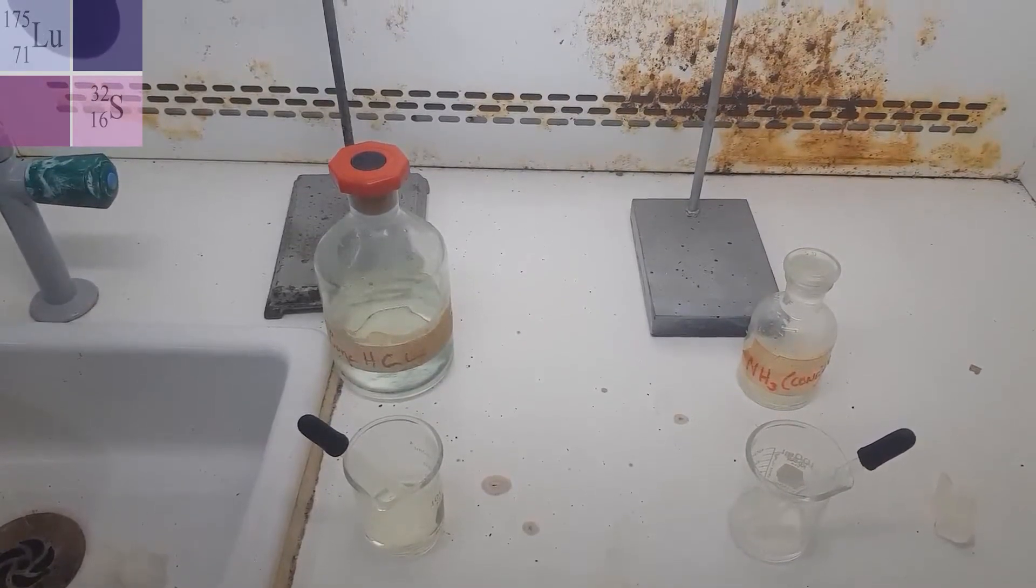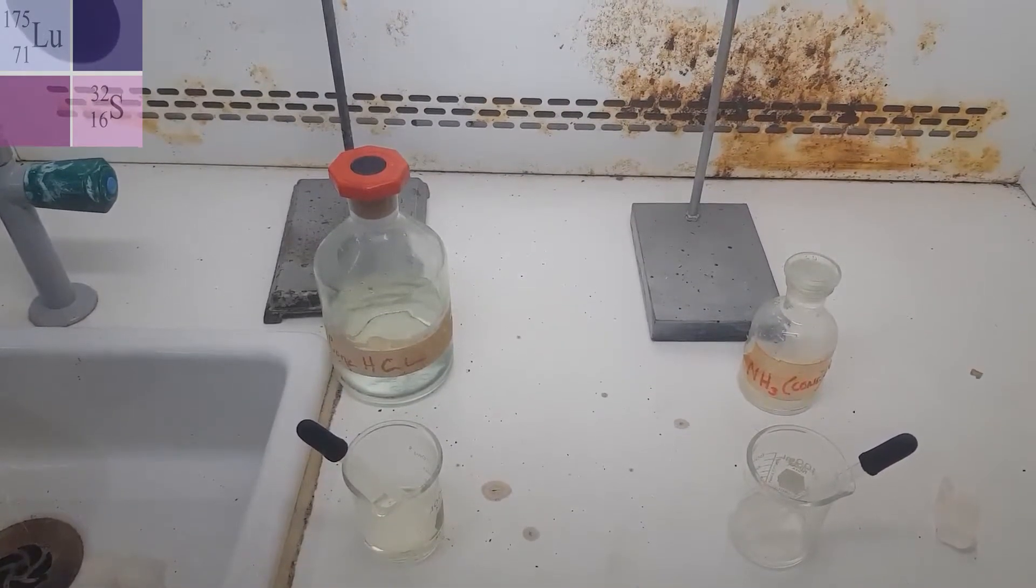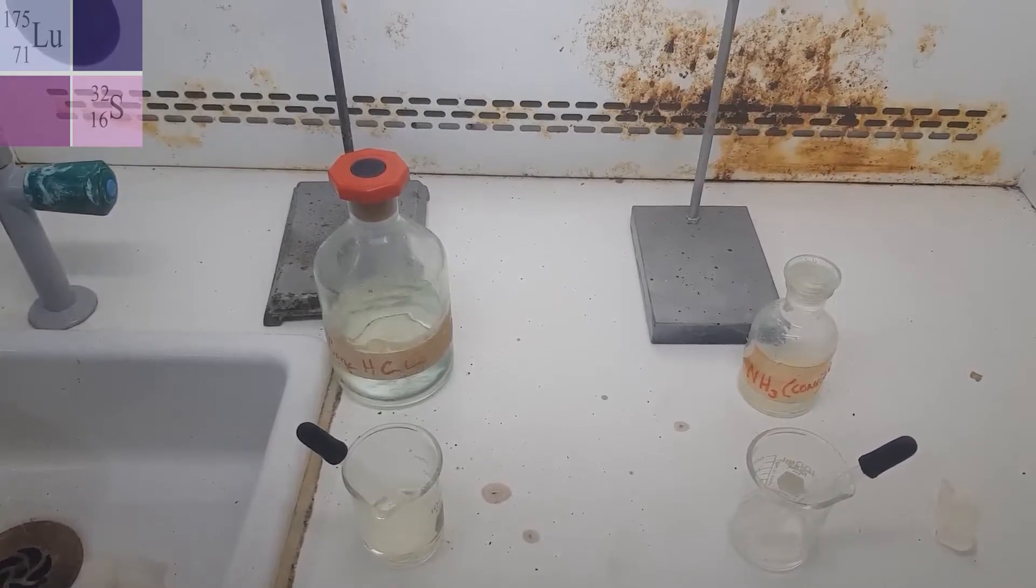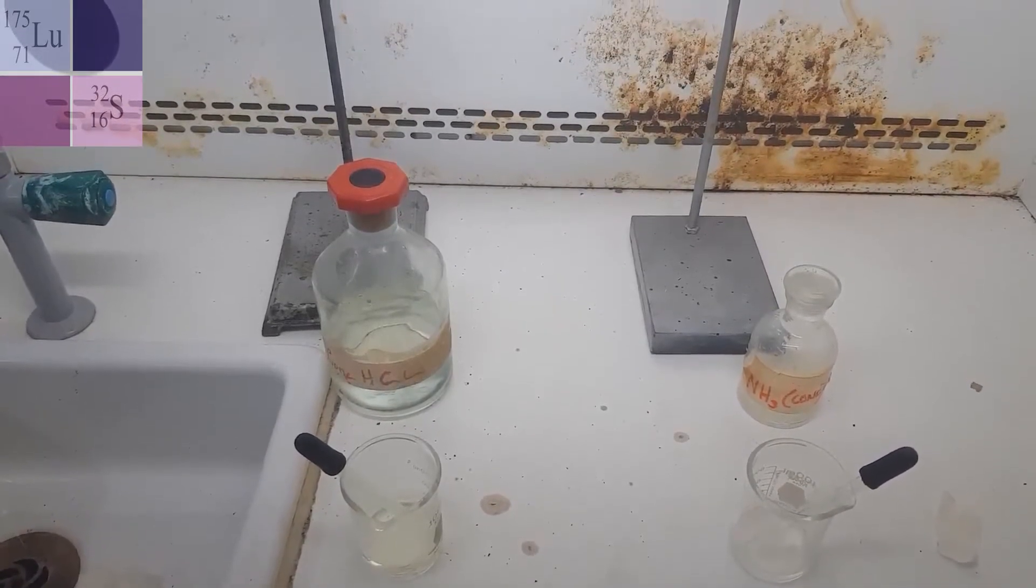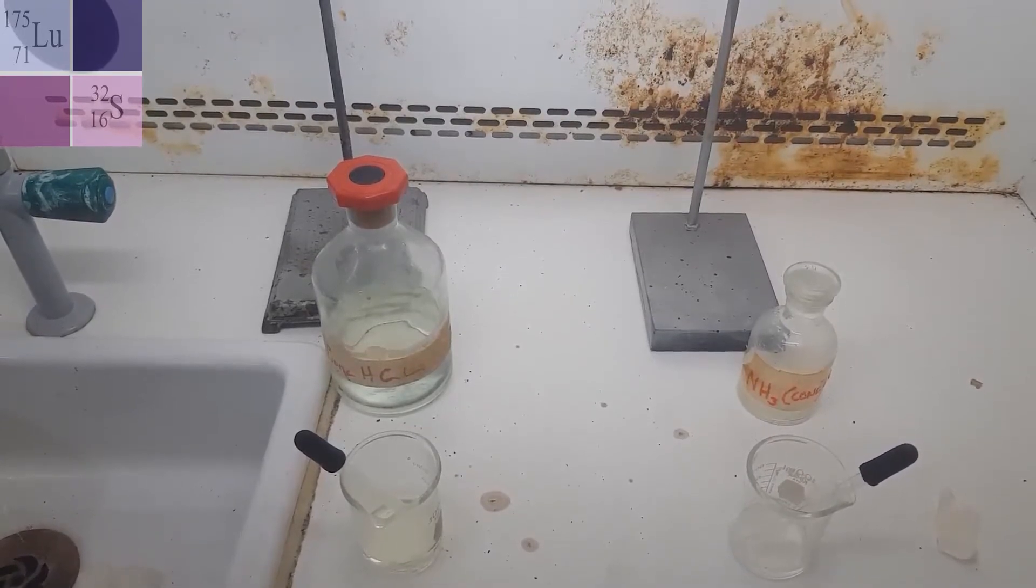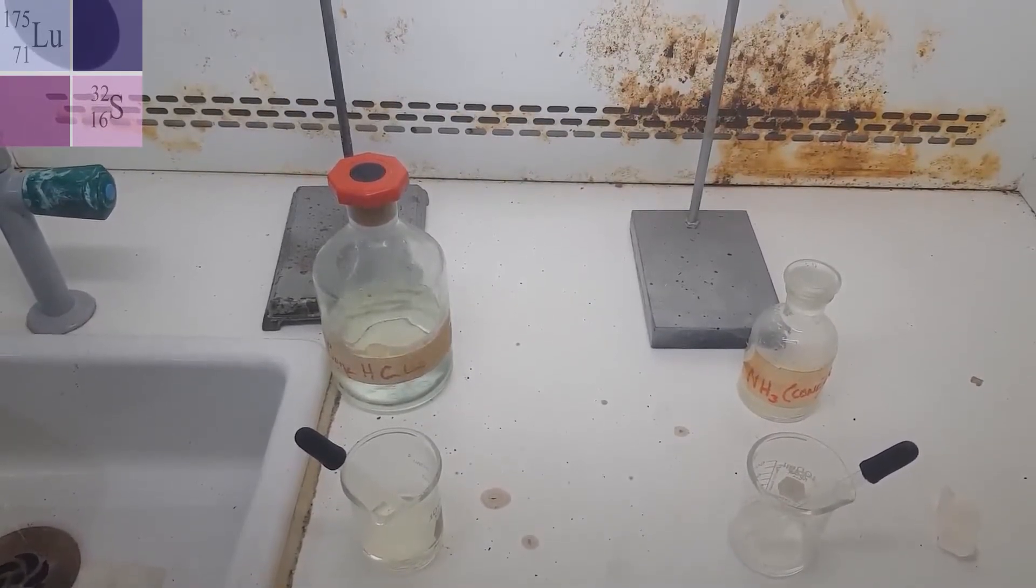So we know what diffusion is. Diffusion is where particles move from where there are plenty particles to where there are few particles until they're evenly distributed, area of high concentration to low, and so on.